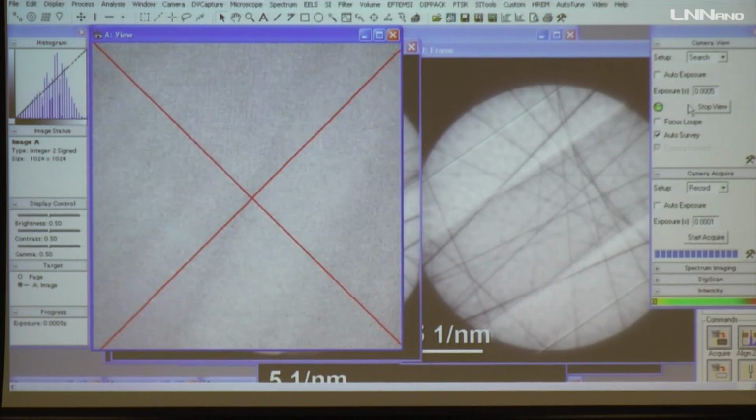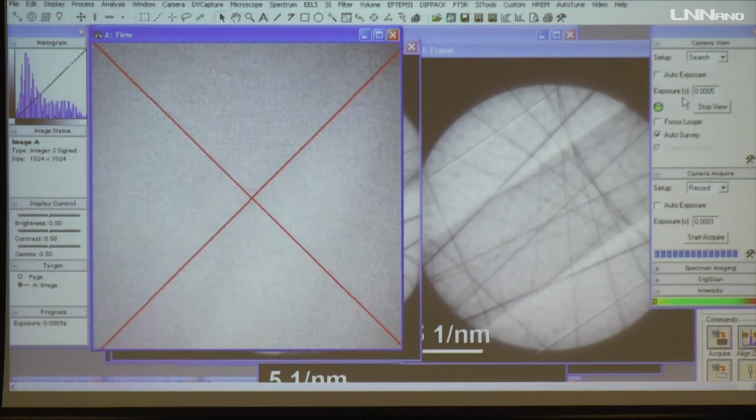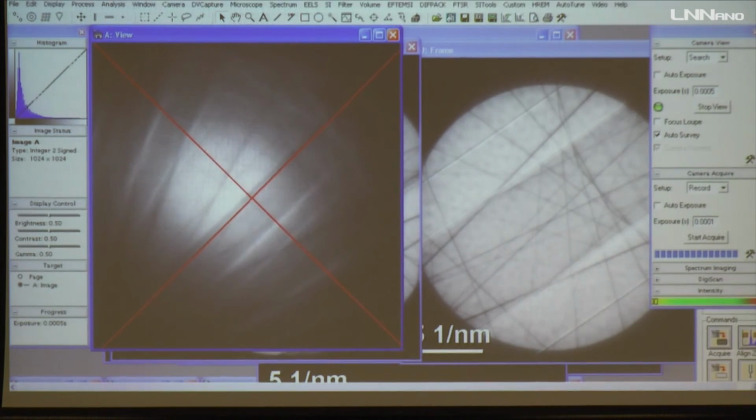And also you need to remember that if you go to a very thick region, the appearance of the whole thing is also enhanced, and the height is not good. It's too thick.